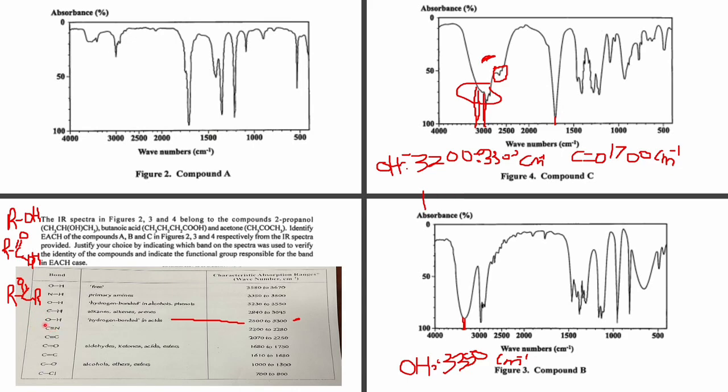So in your ketone, we now have that carbon double bonded to your oxygen presence that we're going to be looking for. So on our IR spectra for your ketone, you're going to see some different intense peaks. This is mainly in your fingerprint region here, and then in your band region you have a few weak peaks.